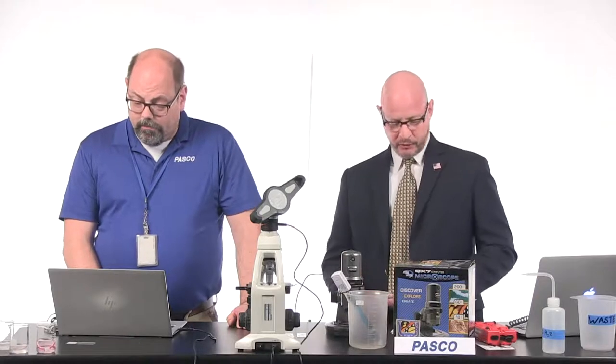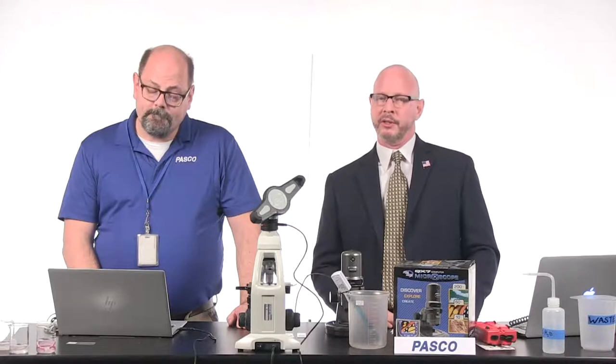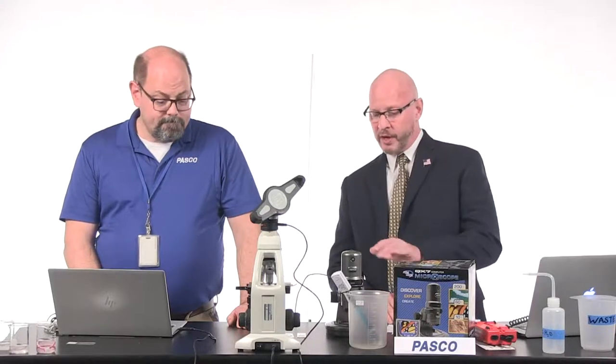That's correct. This very easy picture is something you might want to be talking to your students at home about: cells and the different cell division phases, and we've got a microscope for you.